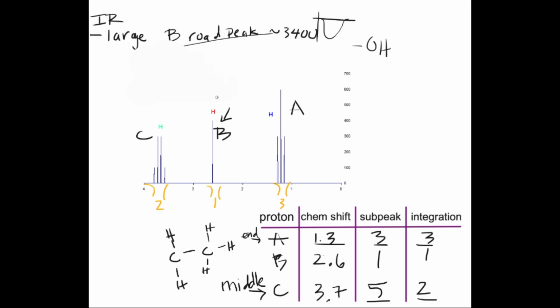This is very unique to OH protons when doing NMR. From the chart, you should be able to see that the NMR chemical shift value can be anywhere from 0.5 to 5 ppm. It's quite a large range, but there aren't many splitting patterns with the singlet, as well as the fact that the OH group made the proton environment C more downfield. From this, we can finally draw the molecule.